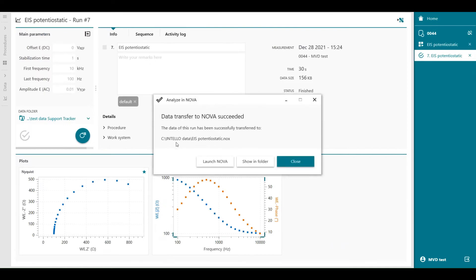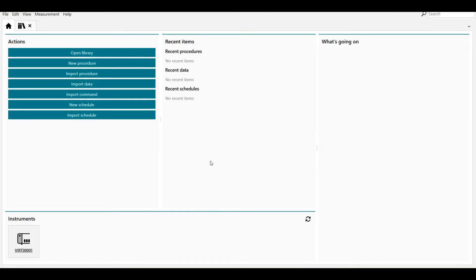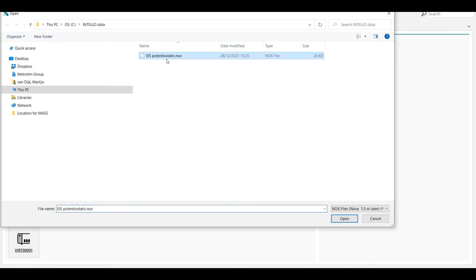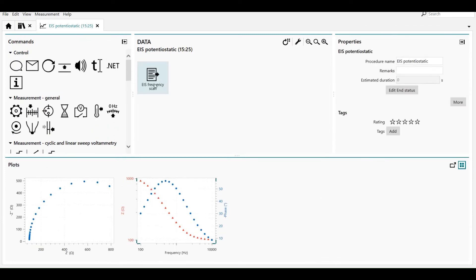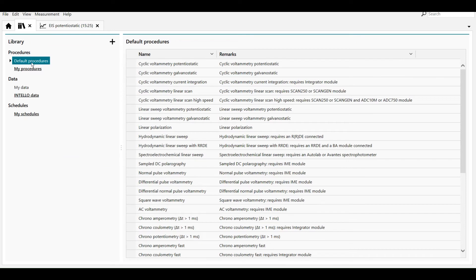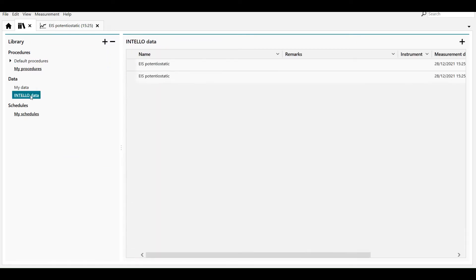This is the location where the data is stored in the Intello data folder, and from here we can launch the Nova software. Nova is already open. There are two ways to import the data: one way is with the import data command, where you can select the file from the folder, or you can create a library by creating a data location — the Intello data location.